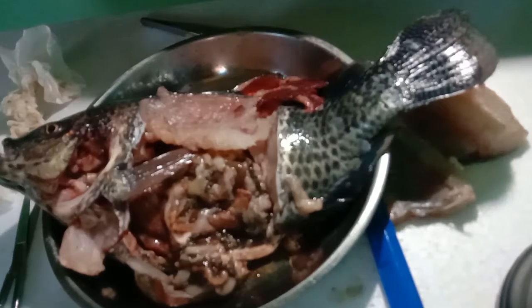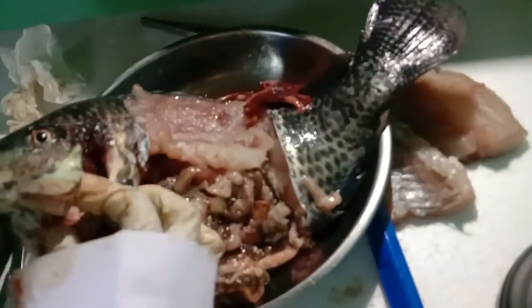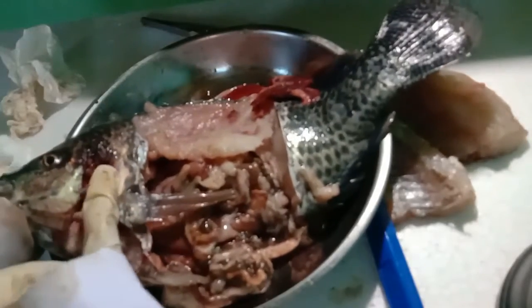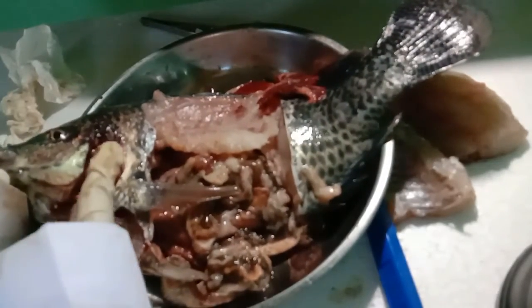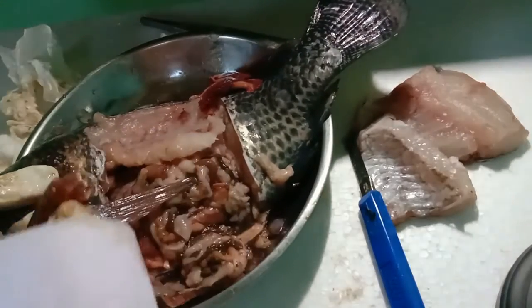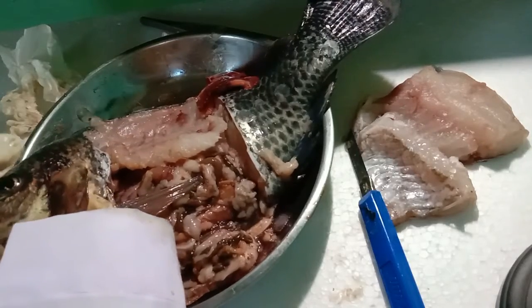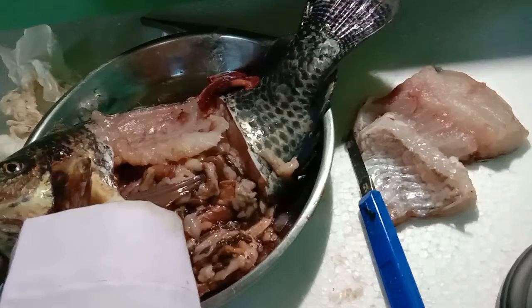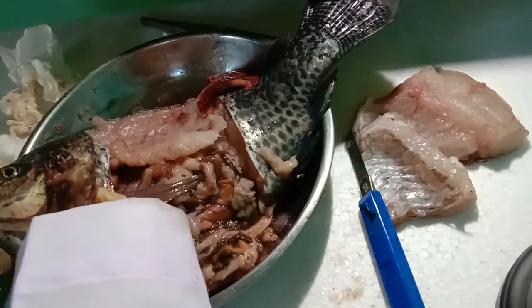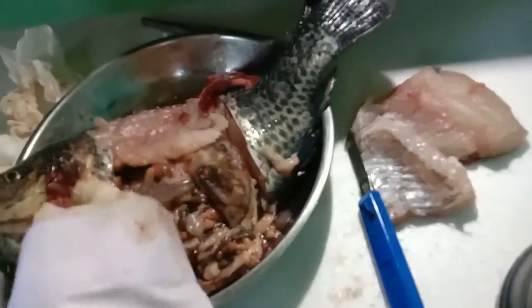The fourth discussion is about the respiratory system. First of all, fish take water through the mouth and out through the opercular opening, or the gill cover, forcing the water over the gills. The direction of the water is maintained by the opening and closing of the mouth.